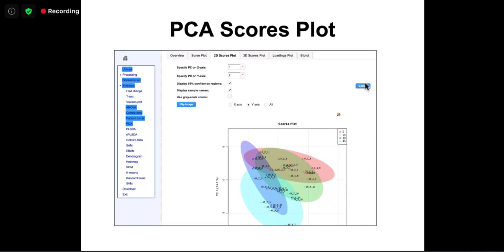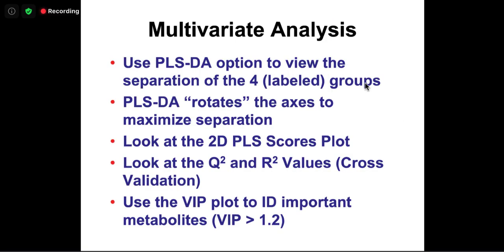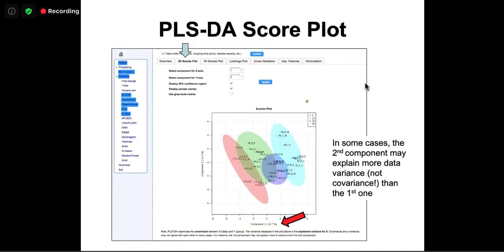But statistical testing, to be honest, I don't get it. I'm not saying it's right or wrong. I don't understand why they want to do that, because PCA is not really meant for prediction. PCA is for looking at your own data structure. If whoever sent it to me can point to a good journal from a respected group, I would like to read more. Otherwise, I tend to ignore that. I do get suggestions to add that, but I'm not convinced.